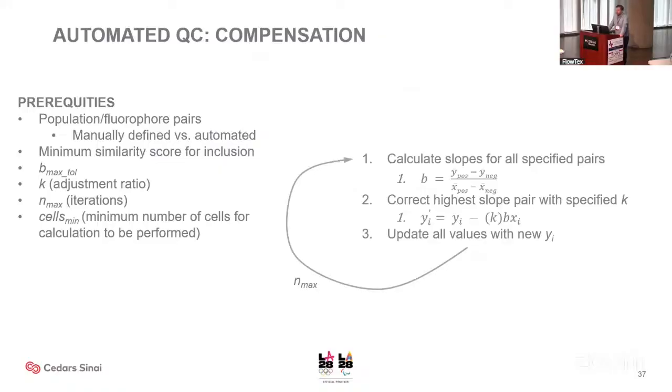So with a sample with a couple million cells, and if we do 1,000 iterations and we're saying 0.1% is our threshold, this takes about a minute or two. It's pretty quick, it's parallelized, so computationally it's quite efficient.